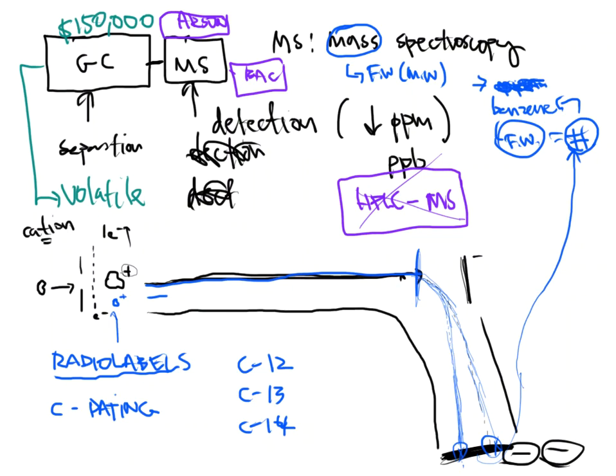Guys, previously we learned about the GC-MS system, gas chromatography mass spectroscopy, and we talked about its purpose. What does it do? And how is it different than just a regular old GC? We said really the MS is the detector unit, and it sees things, and it reports me formula weights of molecules that get sent through. And if it matches up to what I think it is, then it's a good indication that that particular molecule is present. It reduces my workload in a way, and you'll learn more about that later on in the program.